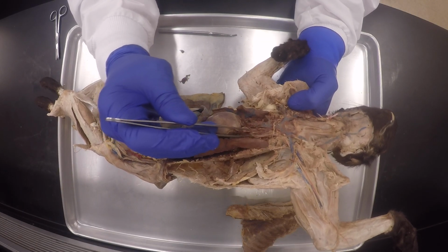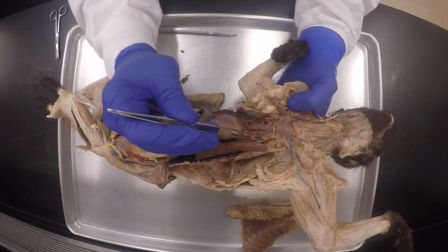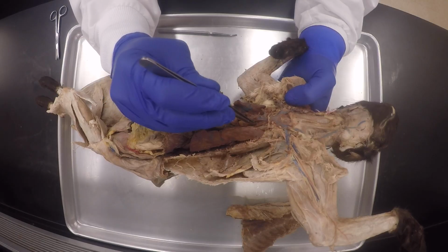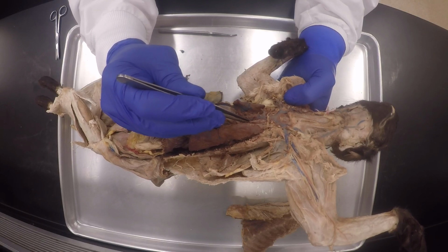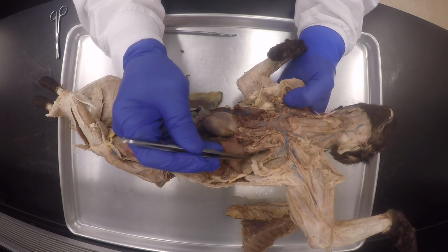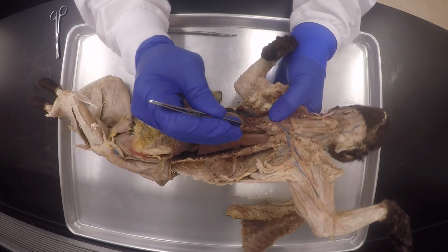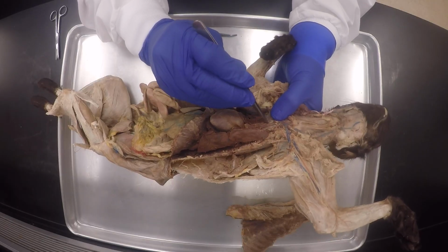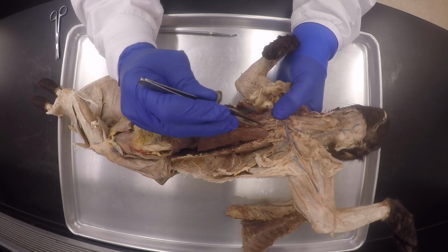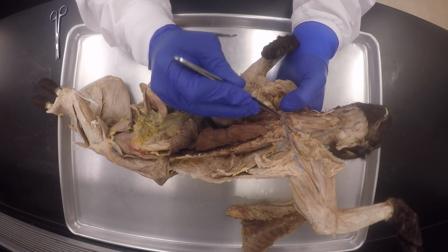So like in the exam, I just want you to say aorta, and you can see this is the left subclavian artery, and this over here, which is kind of not as well infused. Well, it is kind of infused, but it's not as red as I would want. This will be the brachiocephalic trunk. Do you see what I'm saying? So I'm gonna scoot this to the side so you could see what I'm talking about. See, there's the brachiocephalic trunk. You don't see a third branch. You just see the left subclavian artery.